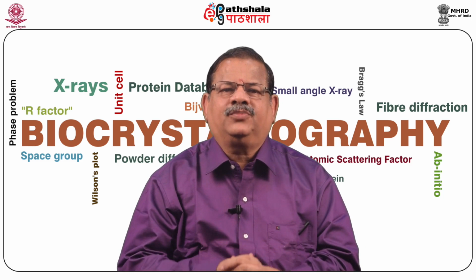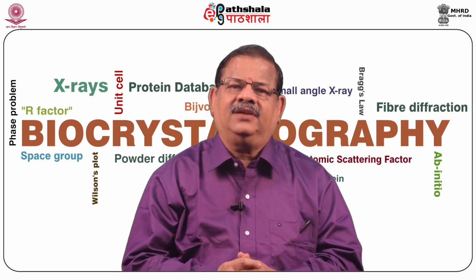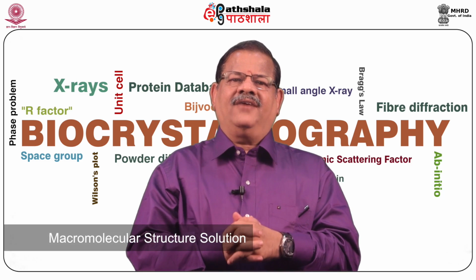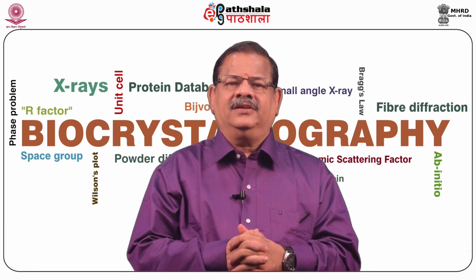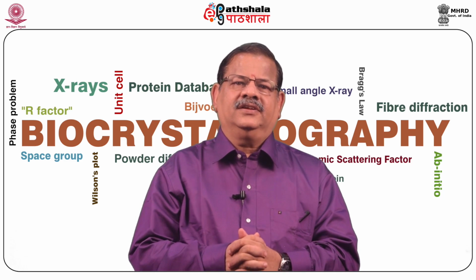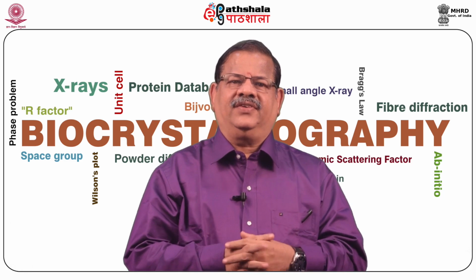Let us now consider the programs within Phenix. Phenix is a comprehensive Python-based system for macromolecular structure solution developed mainly by Paul Adams' group, and Tom Terwilliger has a major role in it. Publications deal with Phenix. So one reference I have given.